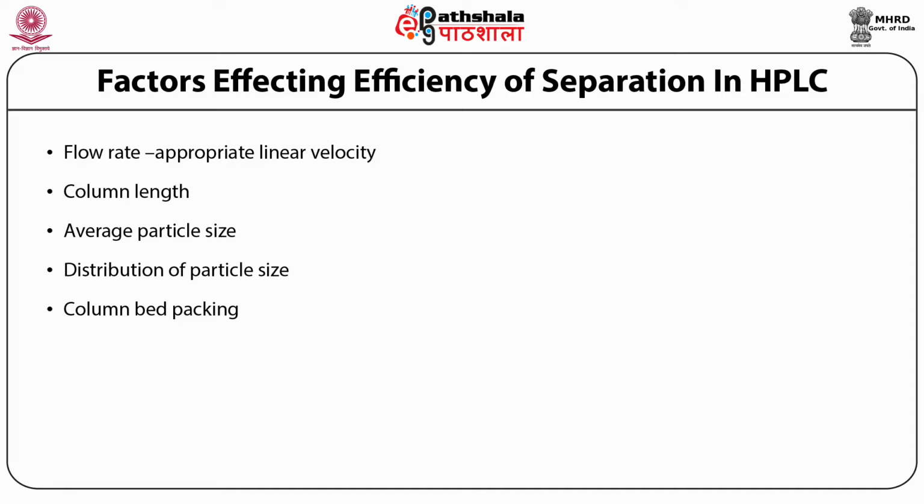If I compare 1.5 micrometer particles with 10 micron particles, there would be a pressure difference of 800 pounds per square inch to 15,000 pounds per square inch. Therefore, the Van Deemter equation explains this kind of problem in analytical separations. So you need to choose the column of your interest, considering the type of machine you are trying to use it on.